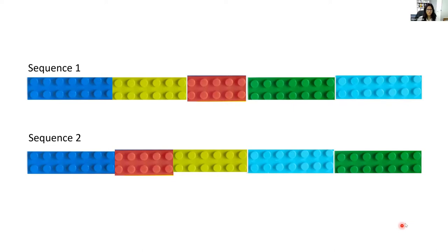No. Okay, there's one vote for no. Do we have opposite opinions? Okay, then everybody agrees that it's not possible to do this, and you're perfectly right. If we just look at them as the intact piece, they will have the exact same weight. So too bad for our mass spectrometer.